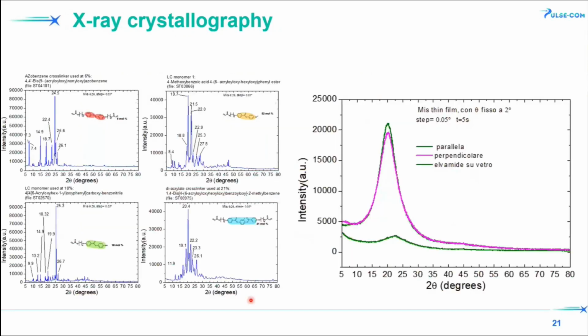Another useful example, when you don't know the mixture and you want to be sure you choose the right polymerization temperature, is to use X-ray crystallography. You see on the left the crystallinity of the monomers, and on the right of the polymer. On the right you have an amorphous phase, so yes, it's polymerized, but this gives another piece of information: it is not a smectic phase.